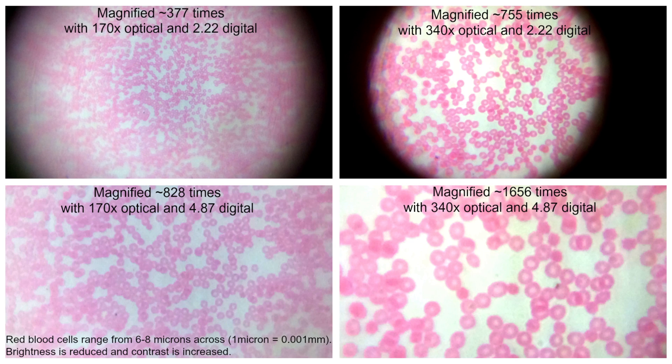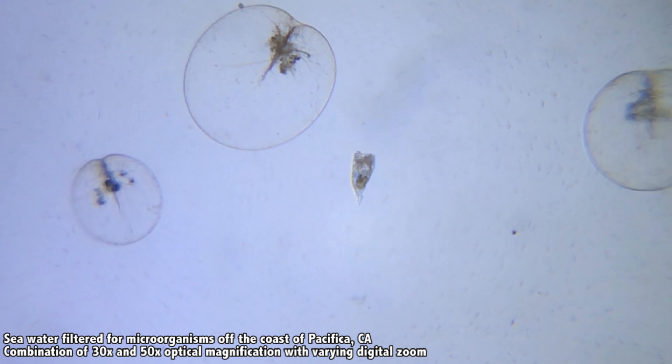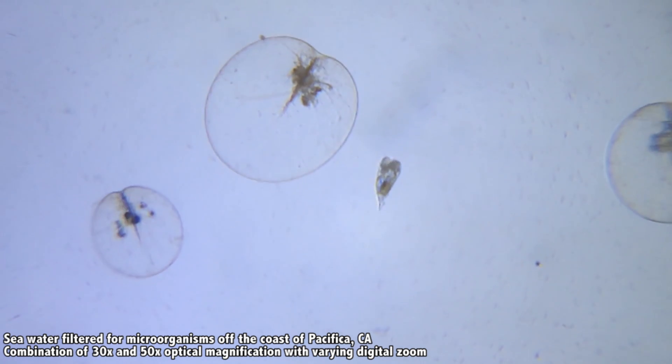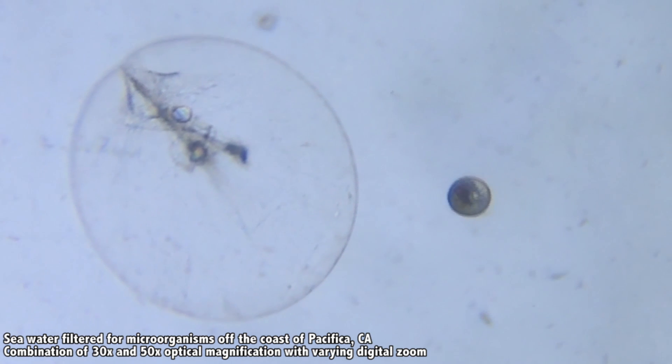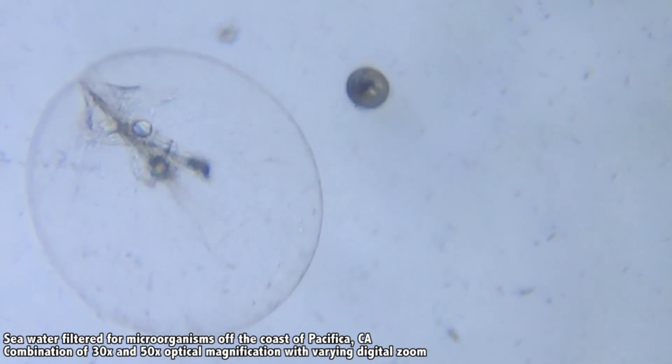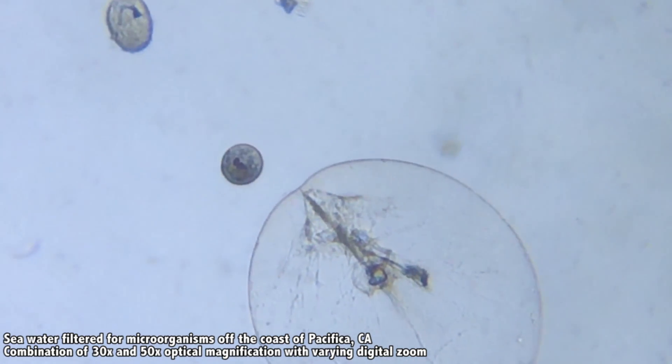All pledges that select power-up will receive this new lens set with 30, 170, and 340x magnification. And not only do you have all this power — because the focus locks in place, your hand is free to move the sample around, giving you the ability to look for what you're interested in or follow what you're interested in.